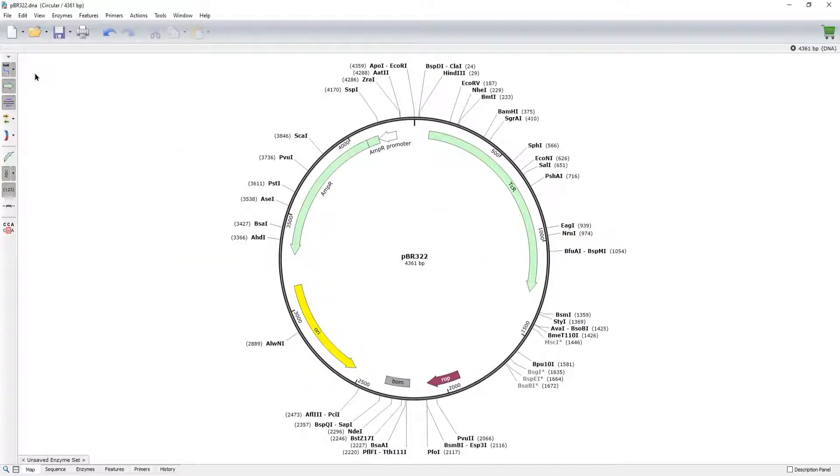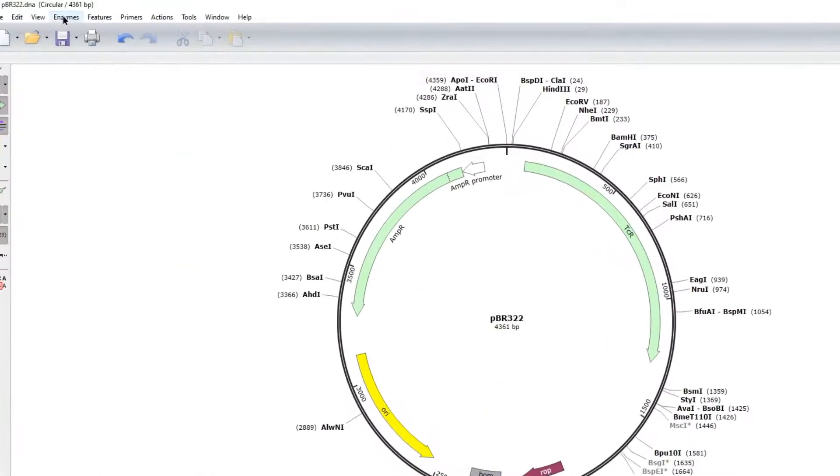SnapGene offers three basic types of annotation: enzymes, features, and primers.